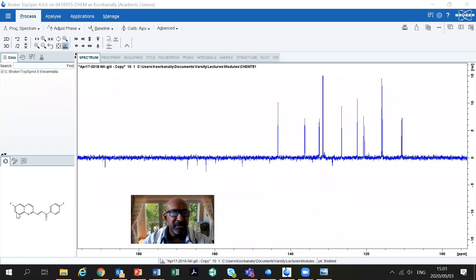I'm going to count the carbons that I have here: 1, 2, 3, 4, 5, 6, 7, 8, 9, 10, 11, 12, 13, 14, 15, 16, 17, 18 carbons.